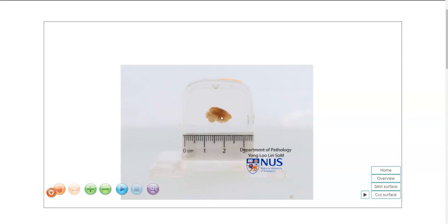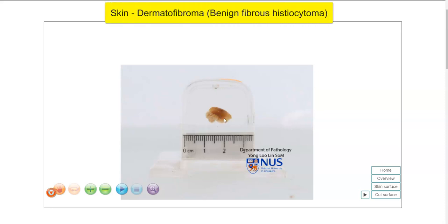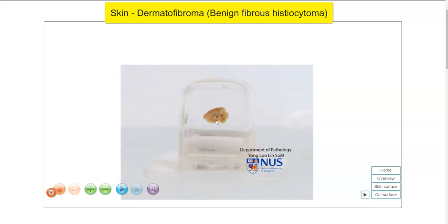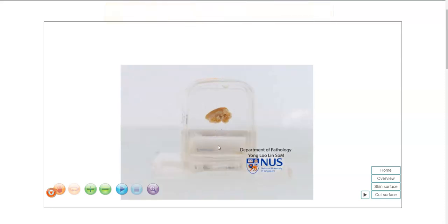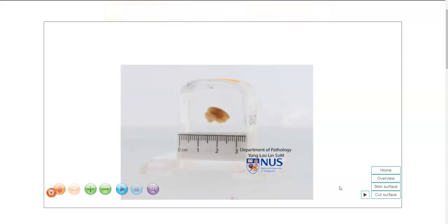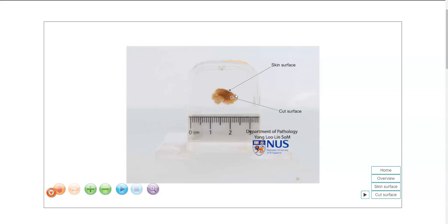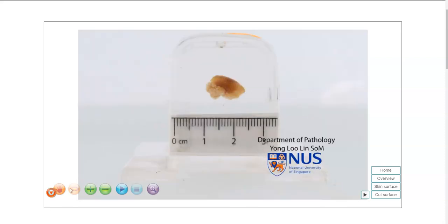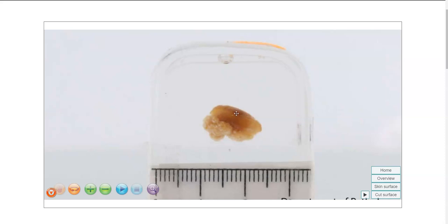Hello, this is a virtual pathology specimen of dermatofibroma or benign fibrous histiocytoma of the skin. We are looking at the cut surface here, and in this view we are not able to see the lesion. Let's orientate ourselves — on the surface is the skin and this is the cut surface. This is the region of the lesion and it is relatively subtle. There is a slight depression and brownish discoloration on the skin surface, and in the dermis there is this ill-defined lesion that appears pale, tan in color.